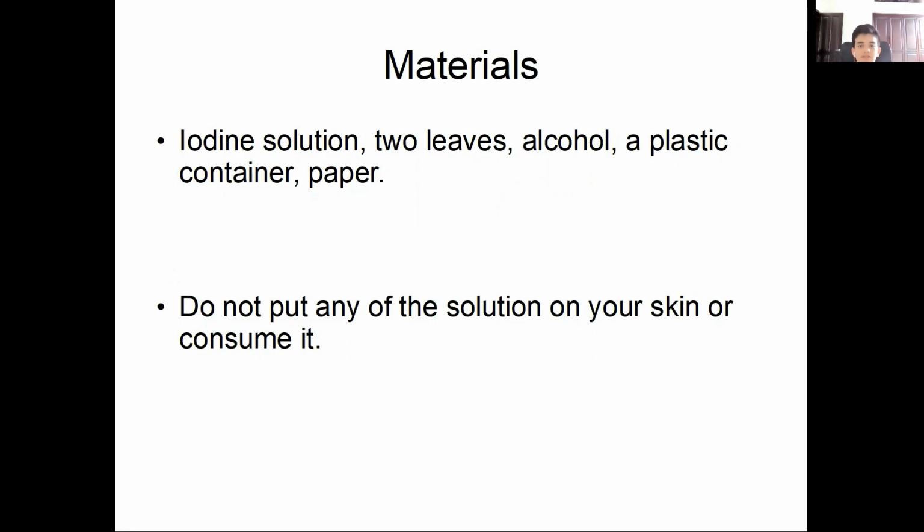Materials: iodine solution, leaves, alcohol, a plastic container, and paper. Do not put any of the solution on your skin or consume it. That's a safety recommendation.